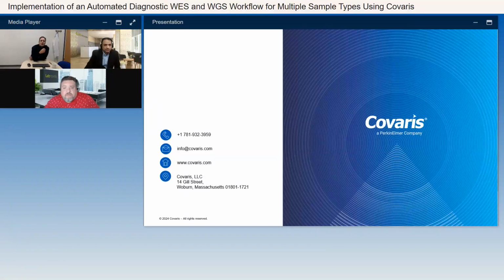Yeah, of course. It's tagmentation on an automated platform, so there's always a challenge to get the correct amount of enzyme into the wells and correct mixing. So it's the same challenging steps as a normal enzyme reaction. And of course, the incubation time is critical, and the order in which you add the components. So that was the challenging part of tagmentation in our workflow for the whole genomes.